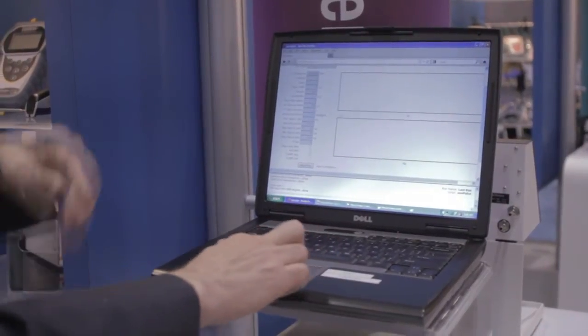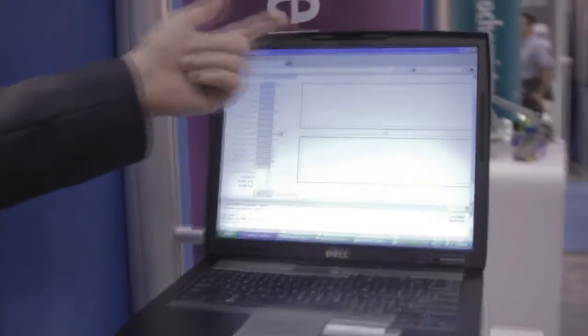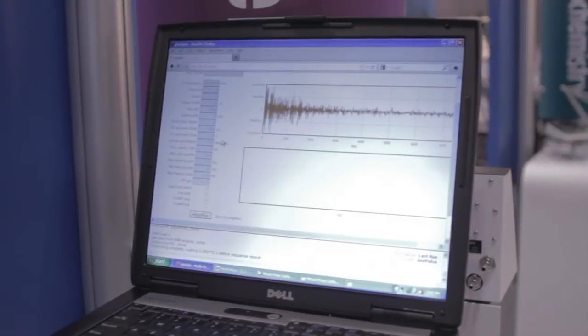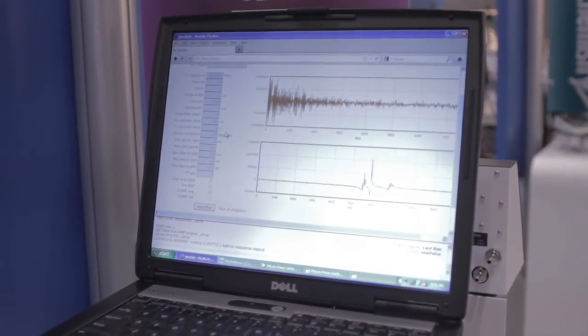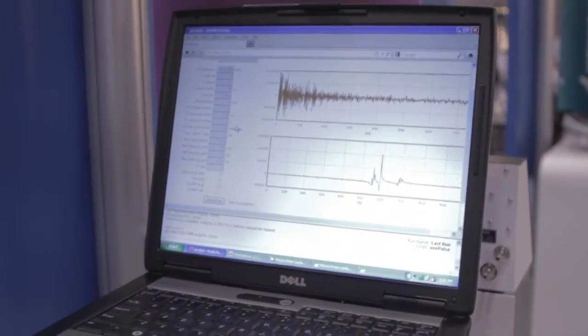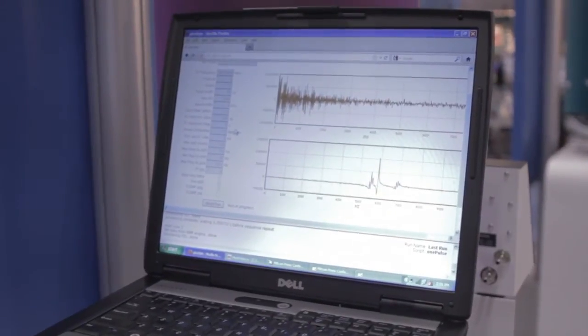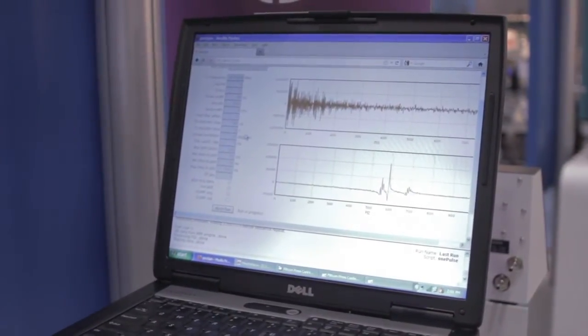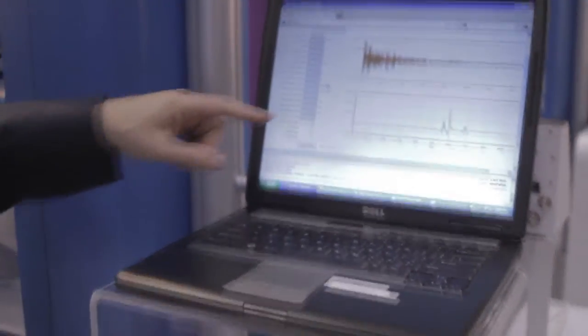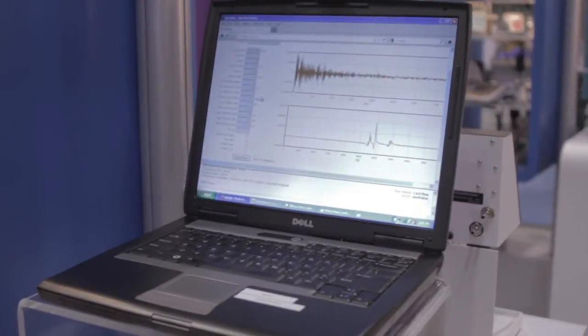And you'll see in the top screen the free induction decay of pulsed NMR. It looks like noise but it's not. It's really the beating signal of a whole bunch of lines in the spectrum that are nearby. And they make a beating signal that's more complicated looking. And then down in the bottom you see the spectrum.